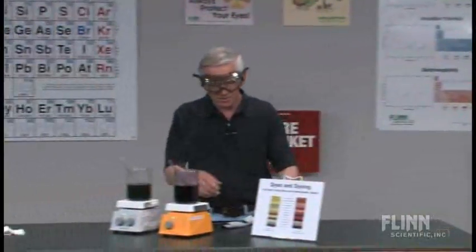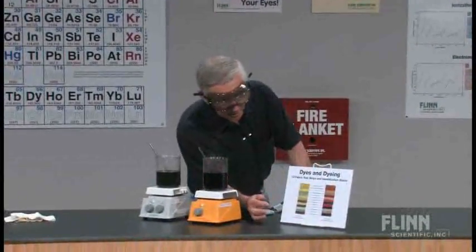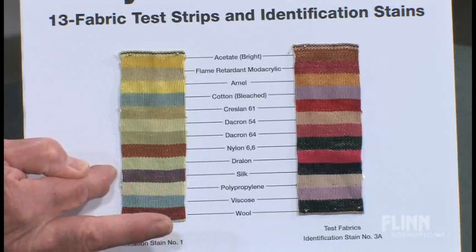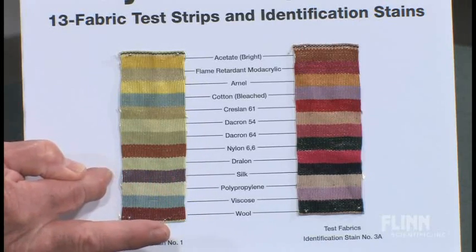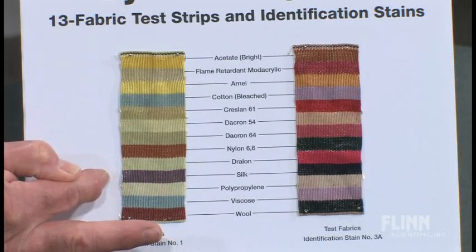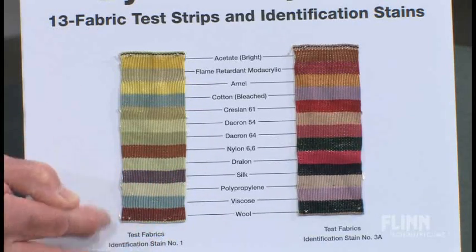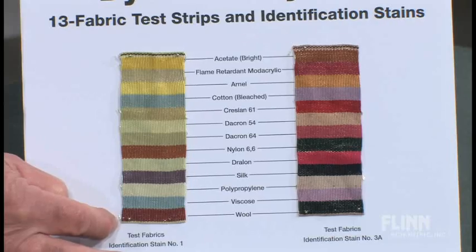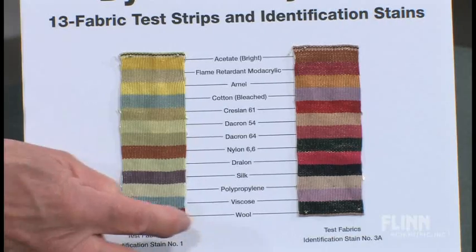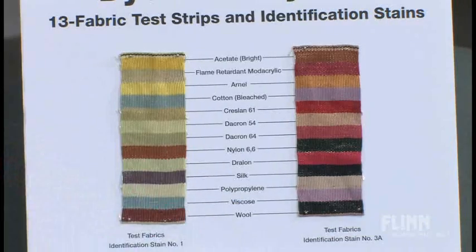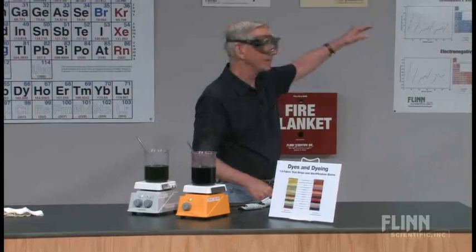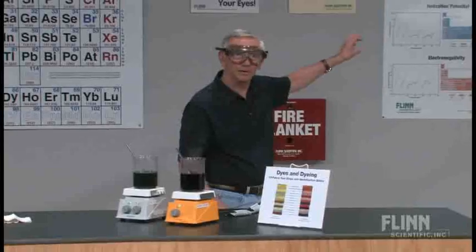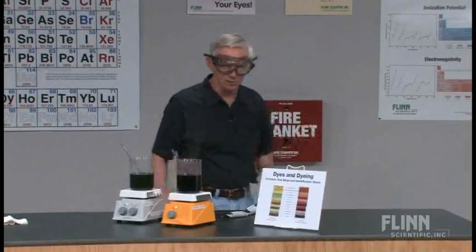How does the silk do on 1A? Oh, nice — intense, kind of a maroon color. Here's wool. Notice again, the ionic and polar dye really well.